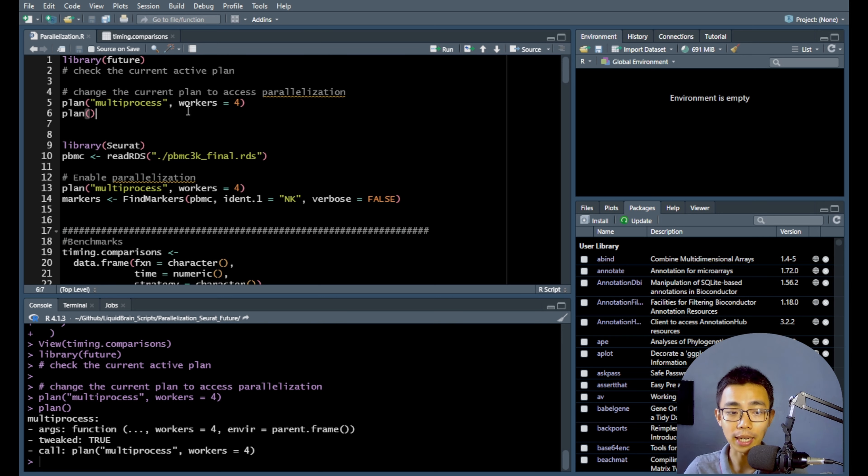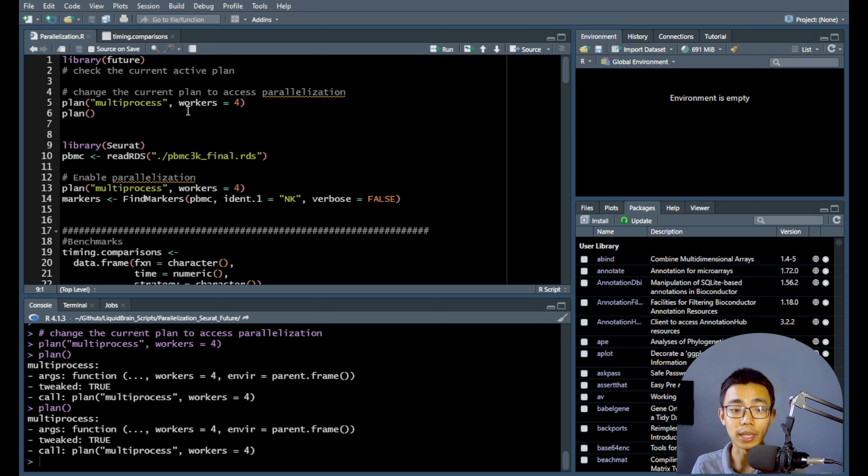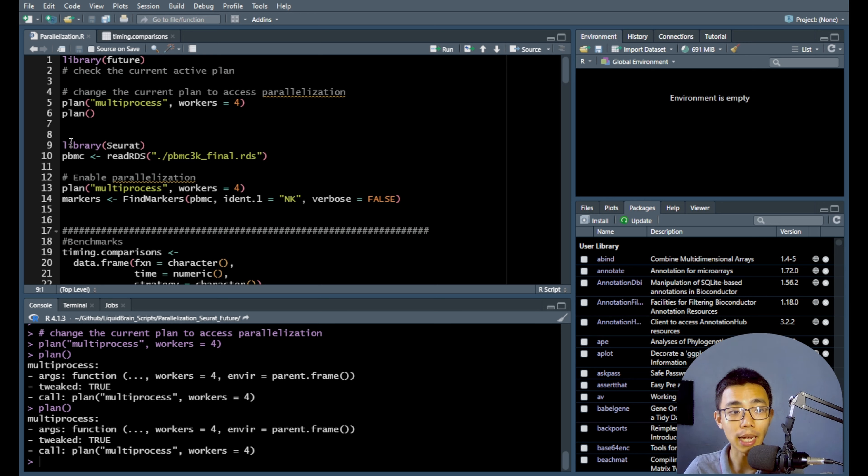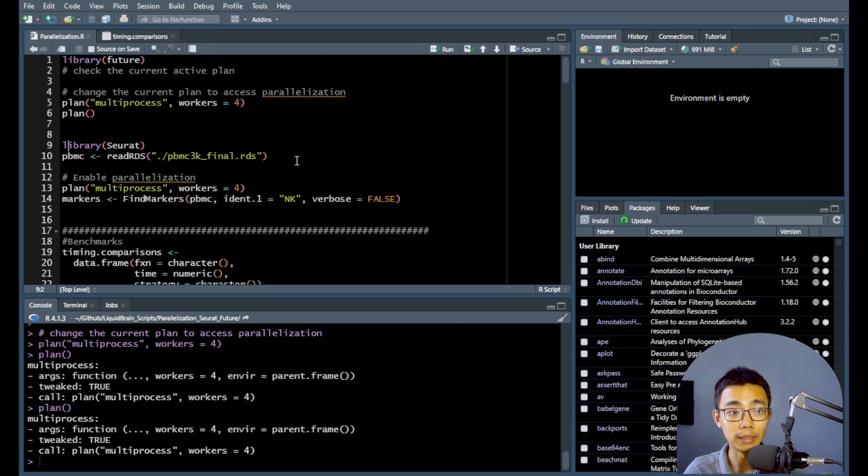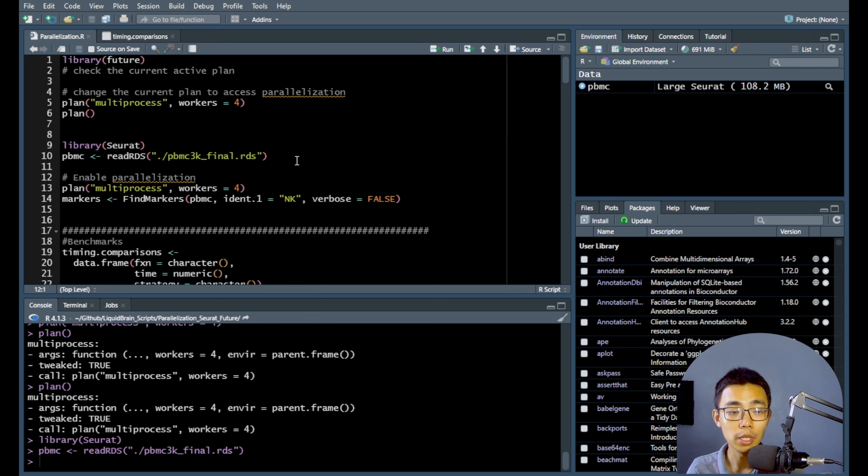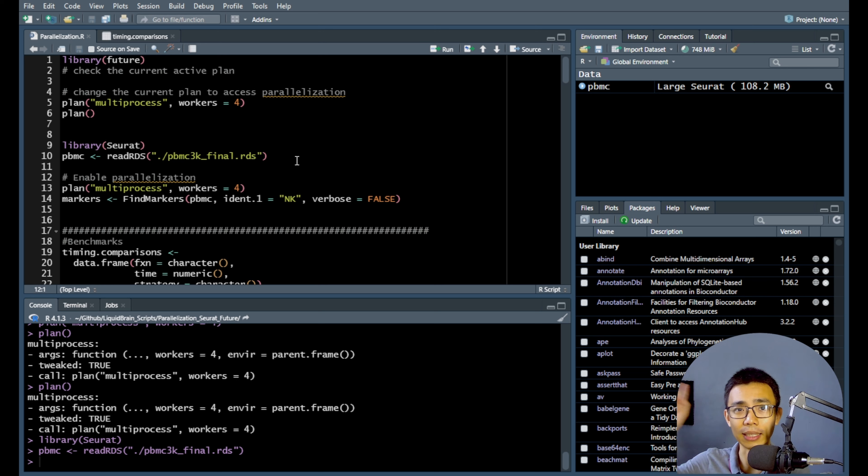And if you want to check the current plan, you can just do a plan without anything inside and you will print out what are the current workers that is. So after you've done that, you can load in your object from Seurat as usual of how you would do that. Or you can actually build your Seurat object from some other means, which you can actually have a look at the find markers video over here.